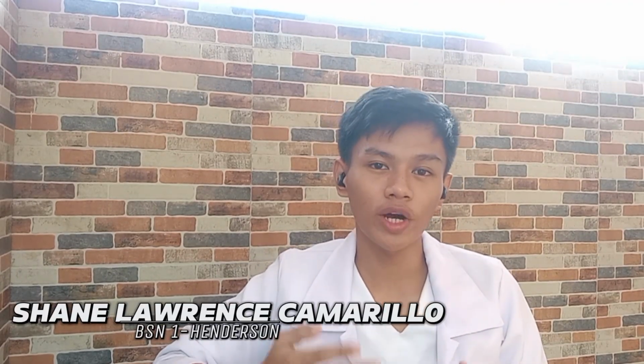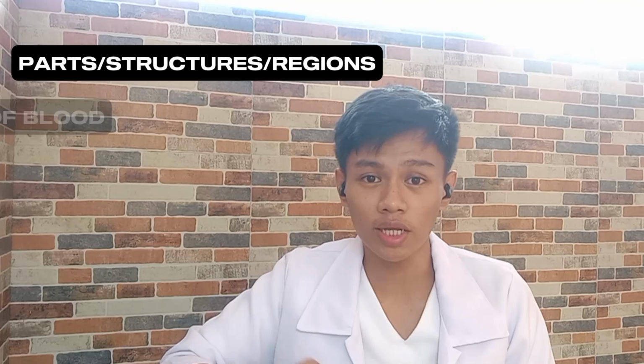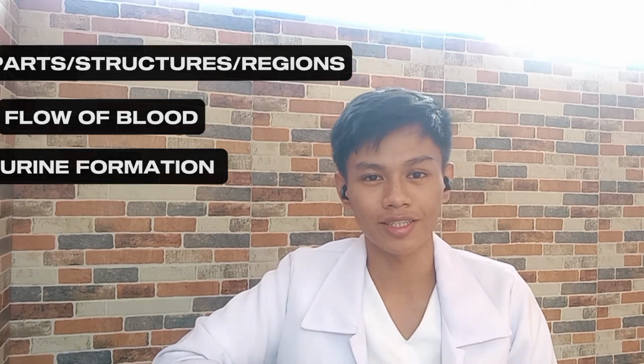Camarillo from BSN1 Henderson. So today I will be going to dissect a pig's kidney to identify and locate its internal and external parts, structures, and regions. After that, I will be going to trace the flow of blood inside the kidney and also the process of urine formation. So let's start.